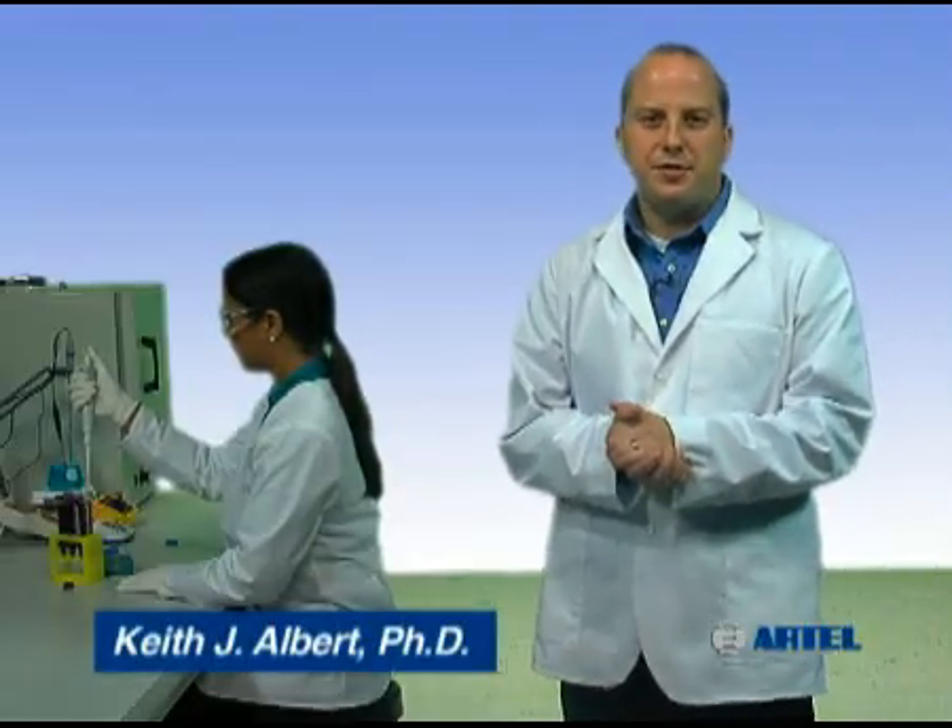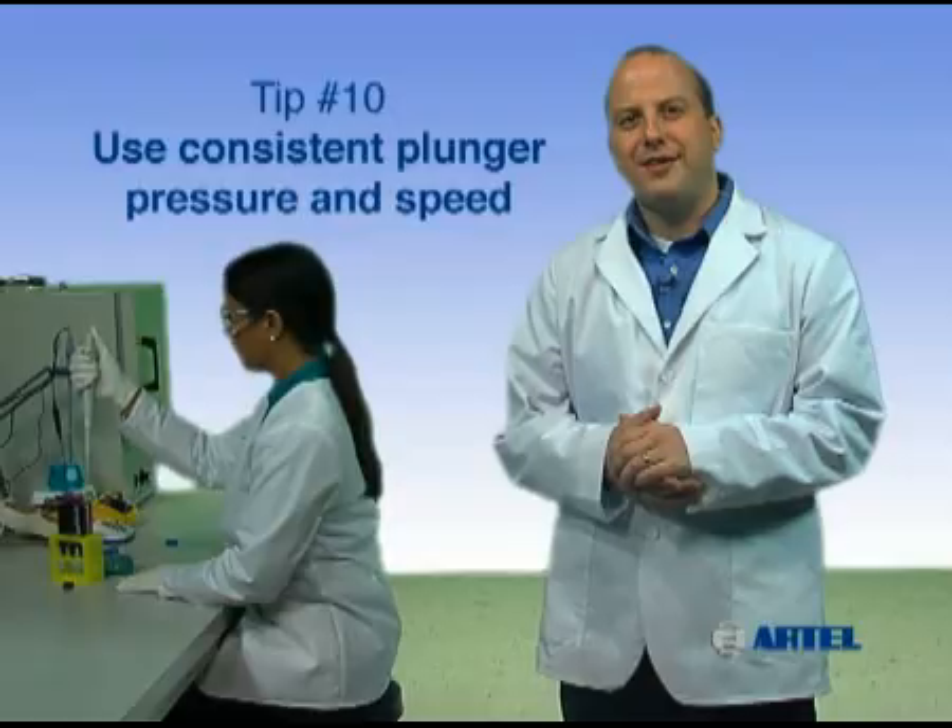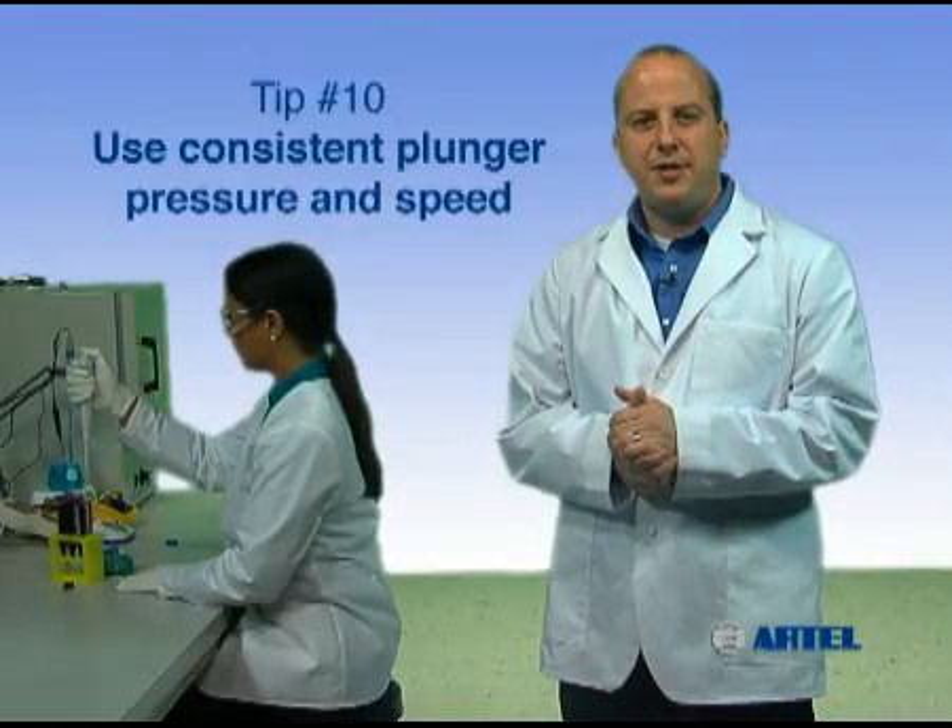Using proper pipetting technique helps you build confidence in your work so you can trust your results. Pipetting tip number ten: use consistent plunger speed and pressure.